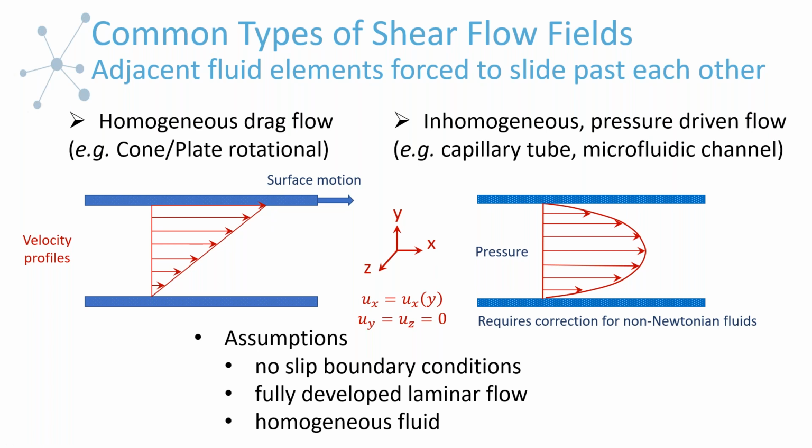And turbulent, if you're not familiar with it, has what is called secondary flows. Instead of these nice streamlines that we've drawn here, they'll have things such as eddy currents that actually add an artificial resistance to the flow. And so those will show artifacts in the data if you go to the onset of these secondary flows that exist.